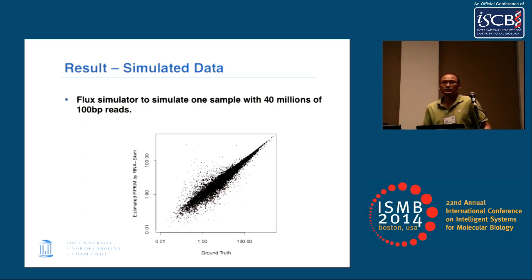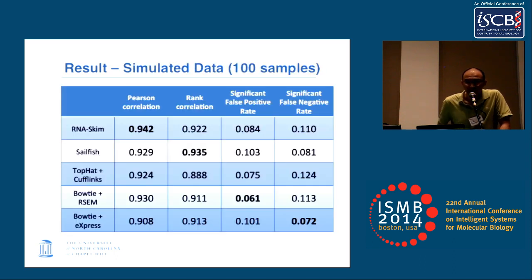Any more questions? Yes, please. I have a question not necessarily related to your method, but in your comparison with the other methods, the last two, I was wondering whether you chose Bowtie over other splice-aware alignment tools, because Bowtie doesn't. Oh, we align the reads to the transcriptome instead of the genome, and that actually got rid of the splice junction detection problem. So what was that reference?